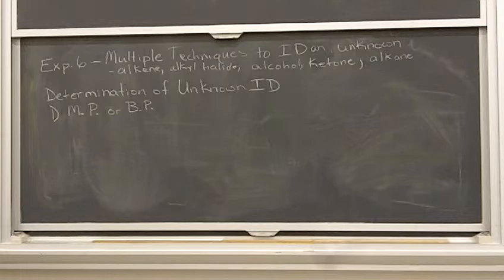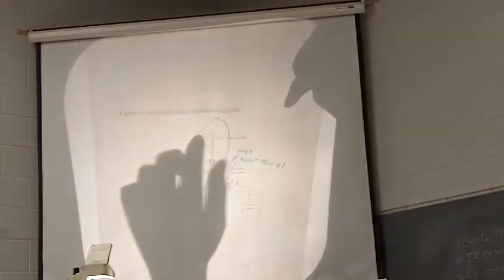So basically we've got our distillation pot. This is our riser or kind of three-way adapter where the thermometer comes in. Here's where it condenses in the arm, and then it goes down into whatever you have on the side to collect there, either a test tube or a sidearm test tube.